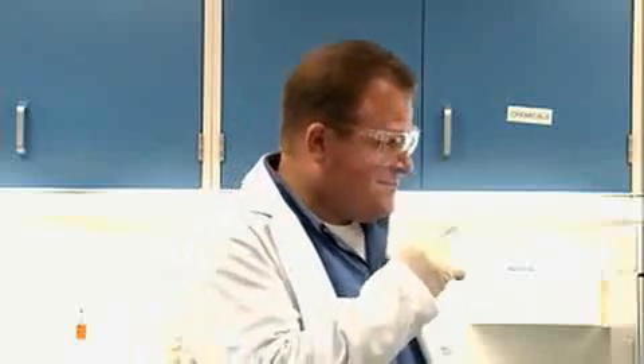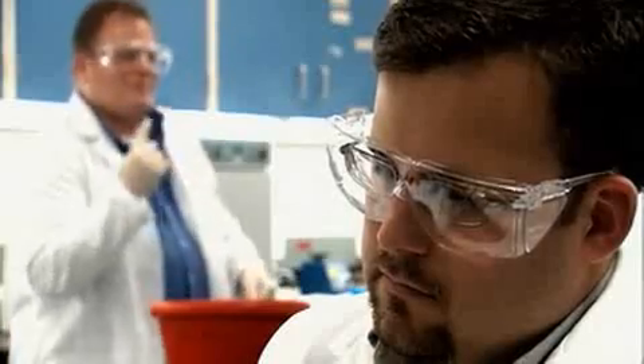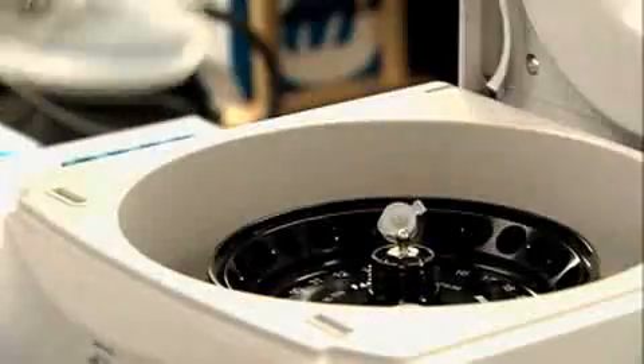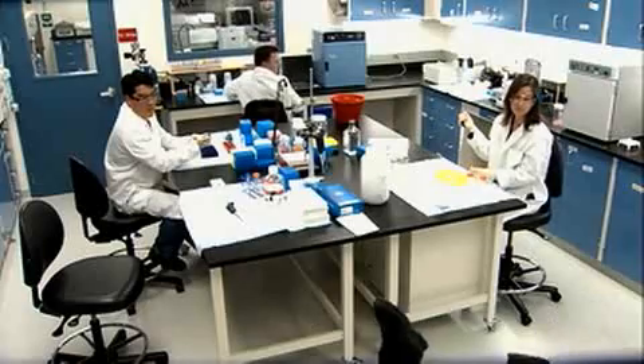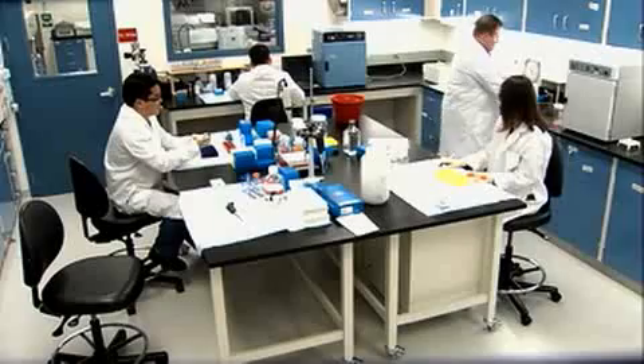I don't think I've seen that before. Like the rest of his teammates, he spins down to 16,000 times G. But as you can see, he really feels it. He's on his way back. Oh! Let's back that up and take a look at that play again.